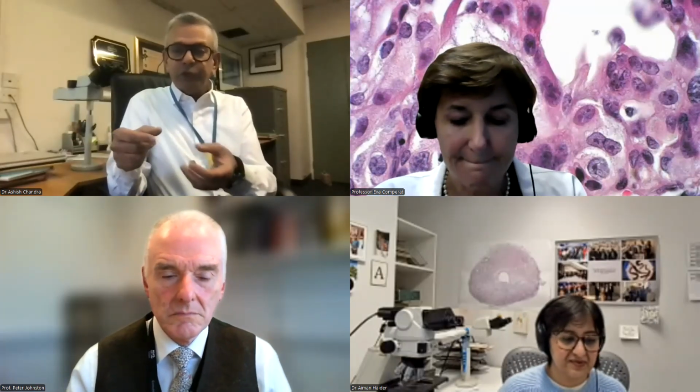Also, you just feel the entire length of the ureter to see where the firm thickened bits are. And usually above the level of the tumor, you will find that there's a hydroureter and maybe hydronephrosis. So the part that is proximal to the tumor will be thin-walled and dilated, whereas the area that is tumor will be thickened. And you could just measure that length. And if it's just 3 or 4 centimeters, you can easily block that in only a few blocks.